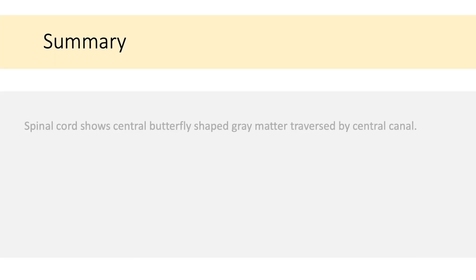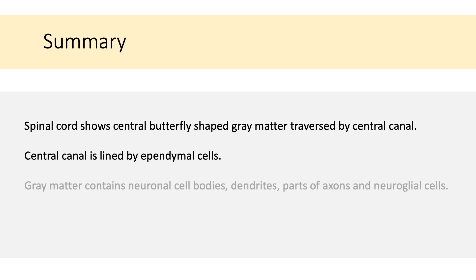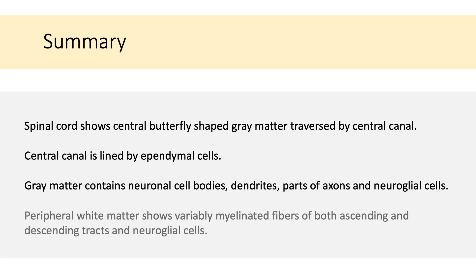Quickly recalling what we have seen so far: spinal cord shows central butterfly-shaped grey matter traversed by central canal. Central canal is lined by ependymal cells. Grey matter contains neuronal cell bodies, dendrites, parts of the axons, and neuroglial cells. Peripheral white matter shows variably myelinated fibers of both ascending and descending tracts and neuroglial cells.